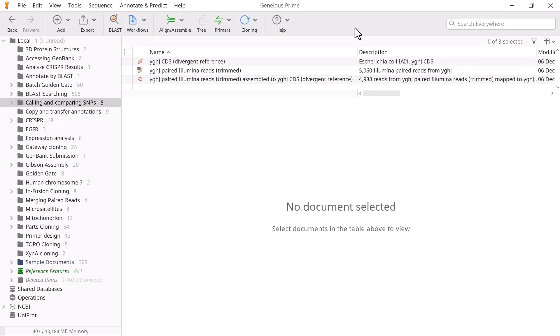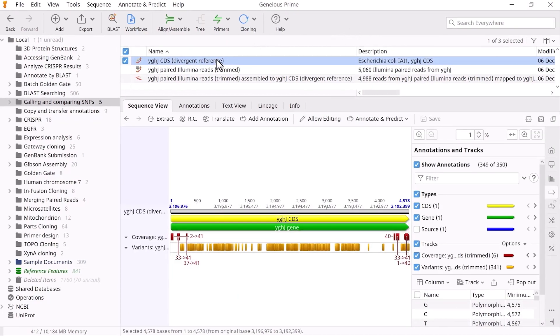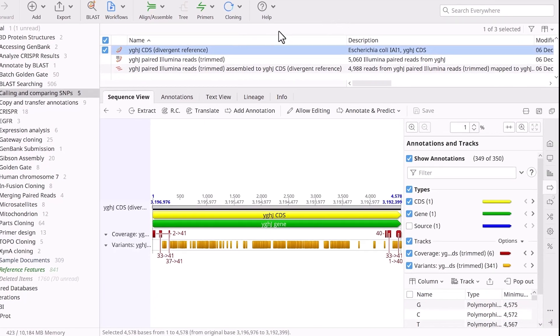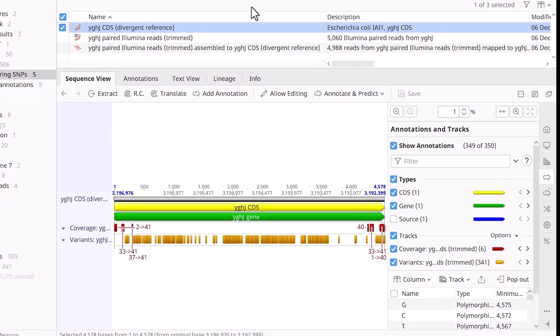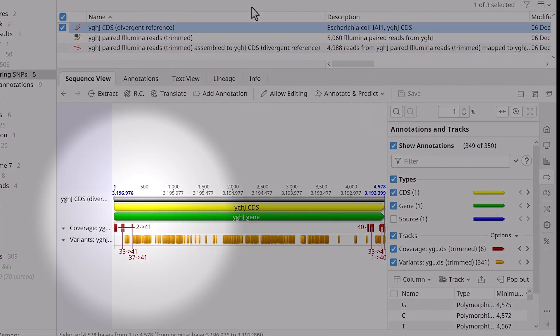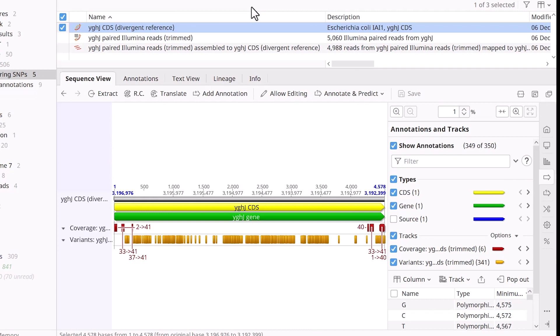To compare SNPs, select your reference sequence. In this example, the sequence contains two tracks – a variant track and a coverage track. The coverage track represents low coverage, specifically where the coverage falls below two standard deviations from the mean coverage.